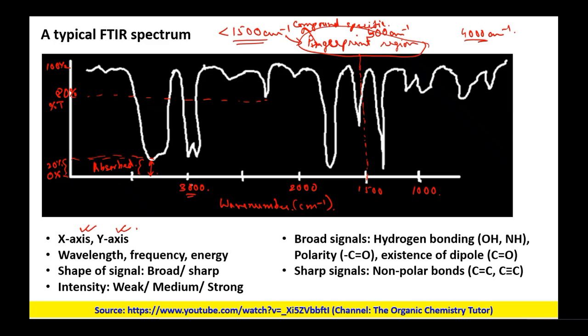This portion is the fingerprint region, whereas this region is the diagnostic region, or functional group region.